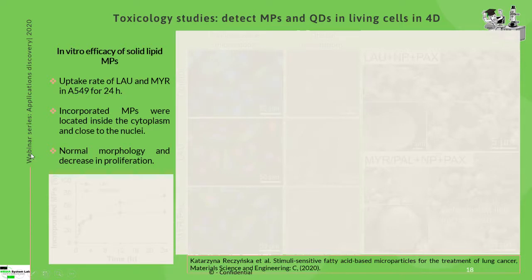In another study, here we have a different application of microparticles. Before, we saw a stimulation of cells with microparticles covered by stimuli. In this case, we have a totally different application: delivery of an anti-cancer drug, the very famous paclitaxel.